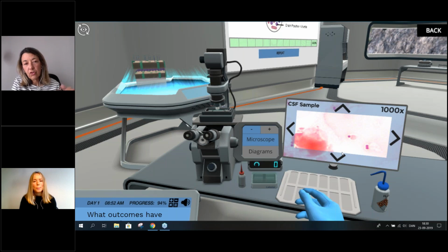We used a quiz that addressed a number of issues related to that laboratory activity, which was bacterial isolation. The control sections did it in the lab, and the Labster sections did it in Labster and in the lab. We saw a significantly higher score for those students who completed it in Labster. Some of the questions were easier, but some required critical thinking, like, if it was positive in this test and negative in this test, what do you think it is? So it was an application question.